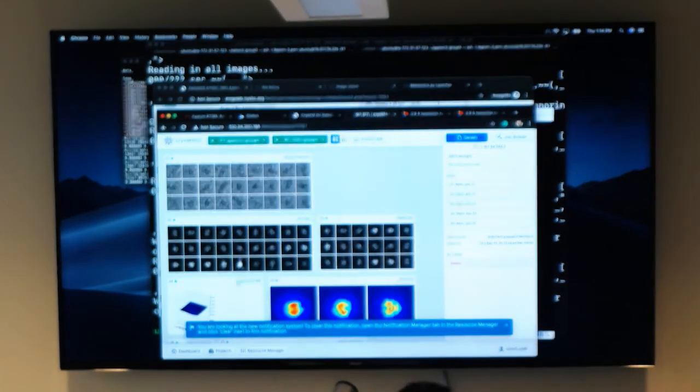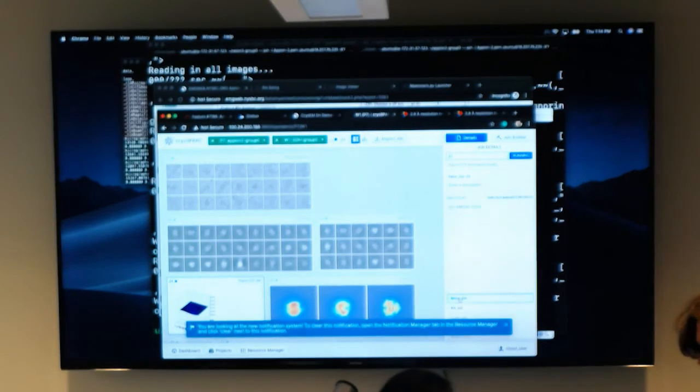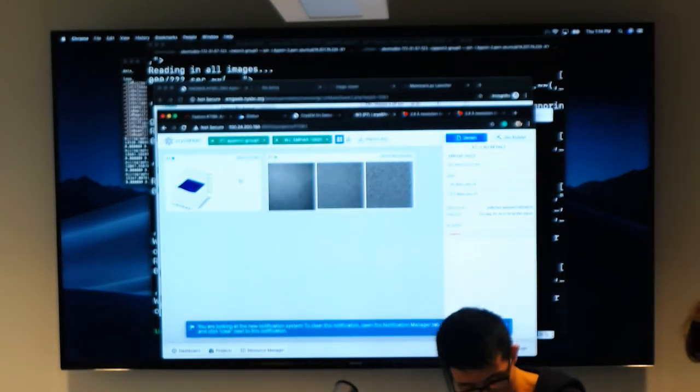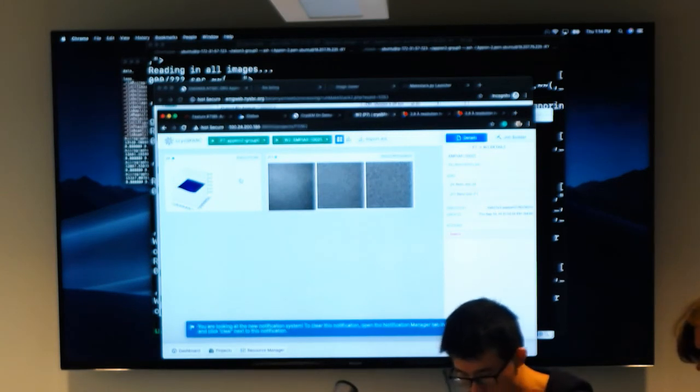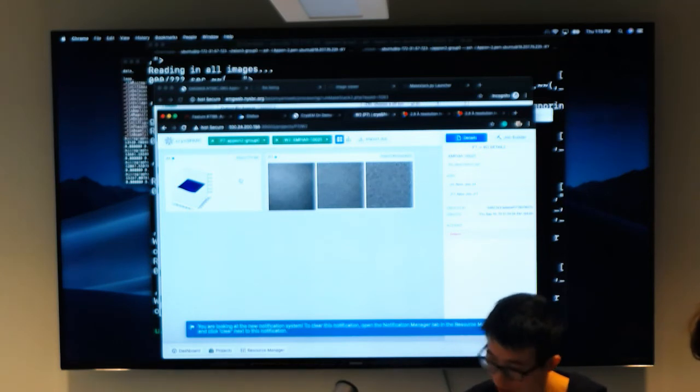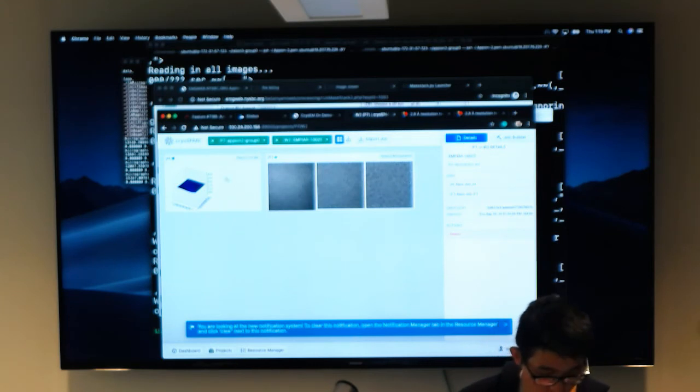So we import volume, but for the particles, are we going to use the original particles? Here you can also decide, it's up to you. You can do either. So we can choose either this one or that one. Yes, both of them should work. They will work, but if you went to the trouble to select a subset, then you would most likely want to use that. Okay. So we should choose this one.